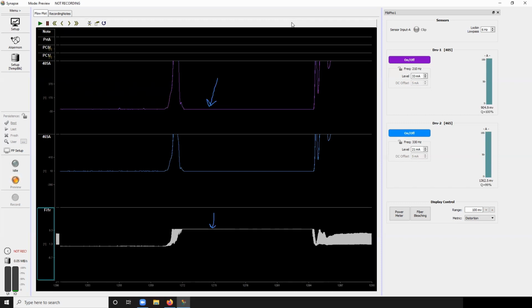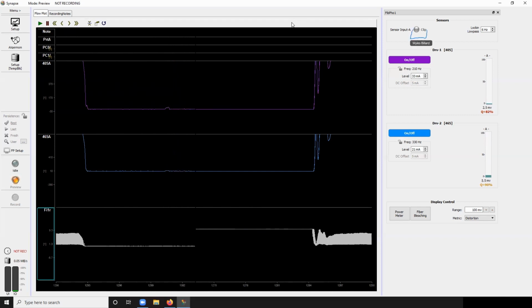And why is that? It's because when you have a flat photosensor line, when you're saturating, there's no 210, no 330, so you have no signal. So you get a dropout in your demodulated signal. And it was quick, but this will also go red if you're clipping. So that's a little bit about the highlighter test.